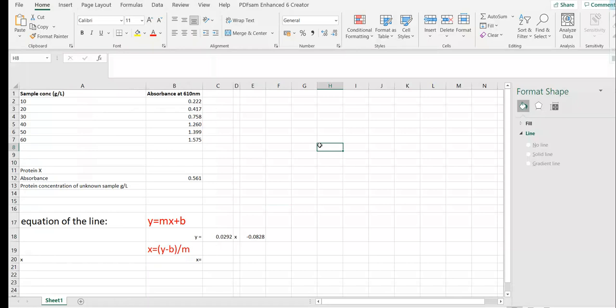In this video, I will show you two ways to find the protein concentration of unknown sample. To determine the concentration of your protein of interest in unknown samples, the standard curve needs to be constructed with known concentrations that give known absorbances. The absorbance is measured at specific wavelength and plotted against the concentration.